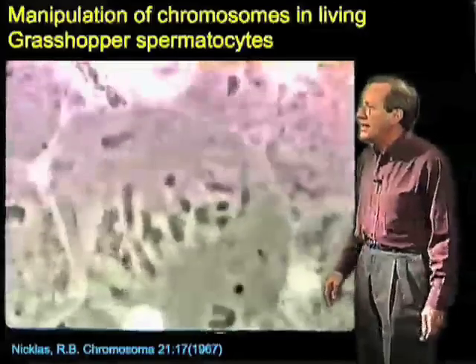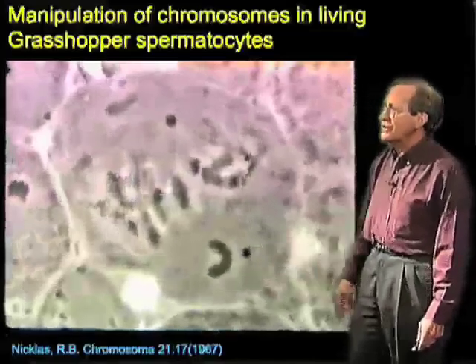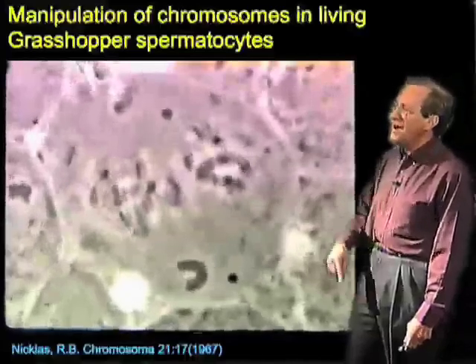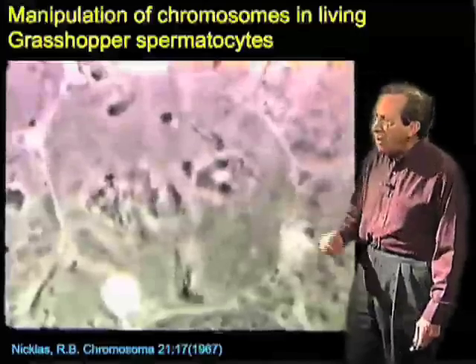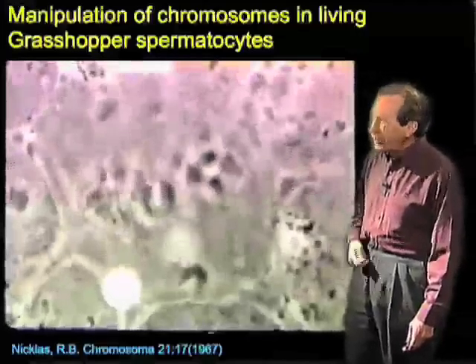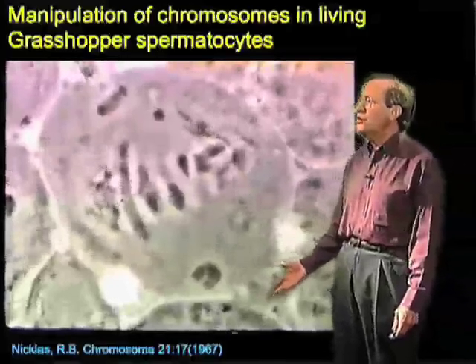There's the needle. It's coming in and interacting with this chromosome, and the chromosome then starts to try to reorient, but Nicholas comes back in and knocks it back. It tries to get up there again, and now he's pulling hard on that chromosome and pulls off that attachment. So now this chromosome is sitting there with no spindle attachment.